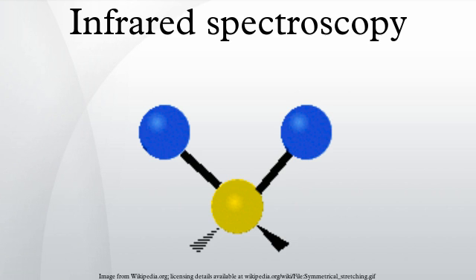In 2D NMR, 2 distinct techniques, COSY and NOESY, are frequently used. The cross peaks in the first are related to the scalar coupling, while in the latter they are related to the spin transfer between different nuclei. In nonlinear 2-dimensional infrared spectroscopy, analogues have been drawn to these 2D NMR techniques. Nonlinear 2-dimensional infrared spectroscopy with zero waiting time corresponds to COSY, and with finite waiting time allowing vibrational population transfer corresponds to NOESY.